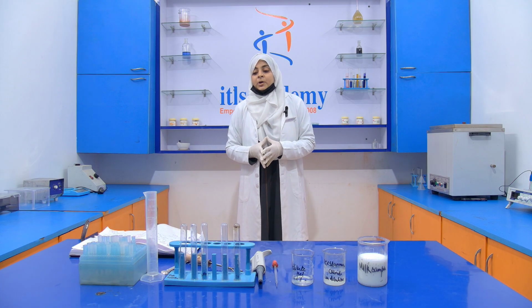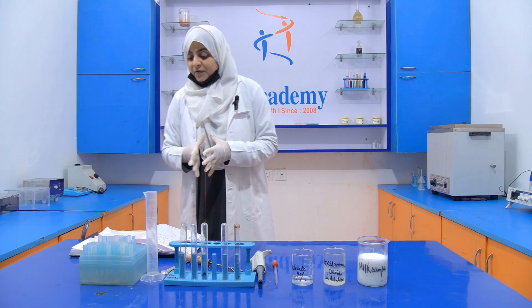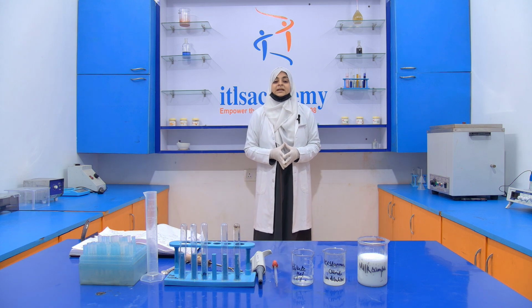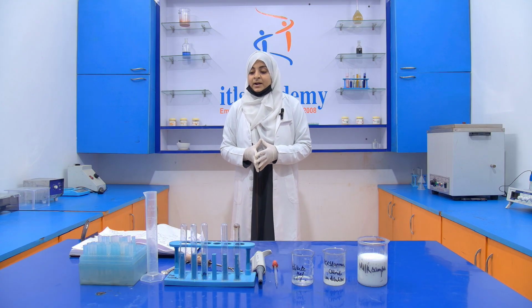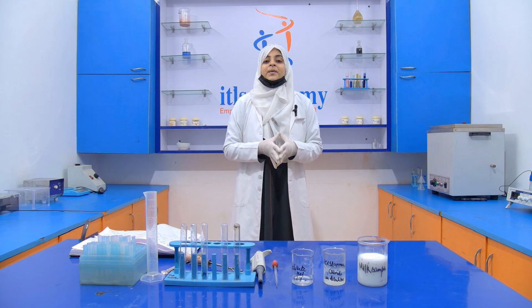So here the mercuric chloride is added into the milk for preservation purposes. But if more than 0.5% mercuric chloride is added into the milk, then it acts as what? It acts as an adulterant, and it is very dangerous for the health of human beings.